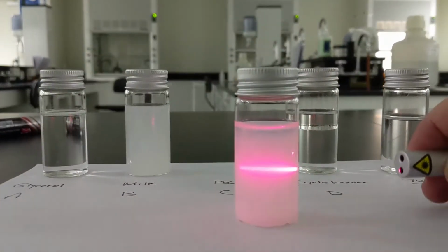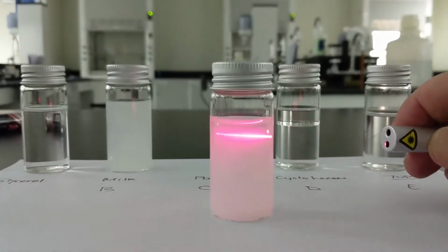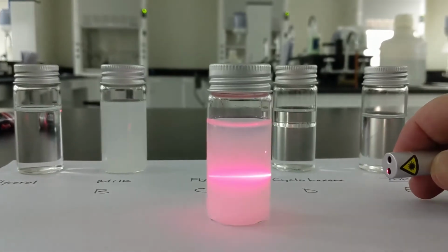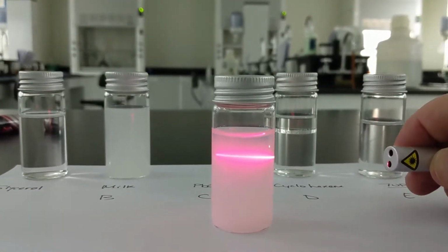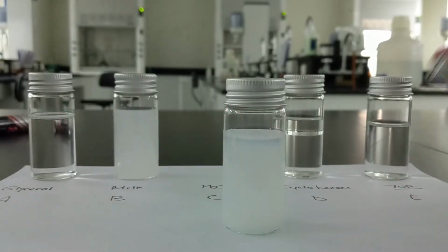Let's take PbCl2. So PbCl2, the same thing, but I'm getting a much more prominent light. You can really see the light inside that suspension or colloid.